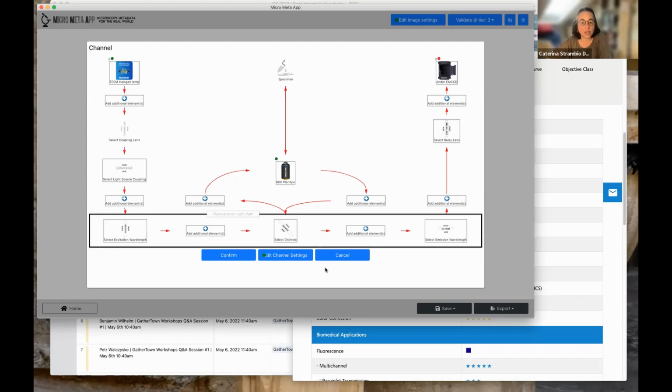People are not going to do it. I totally agree. Unless there are reasons, but if we find a way of meeting people somewhere along the usability spectrum that is closer to them, while we're waiting for things that are done automatically by the manufacturers, and we're working with the manufacturer toward that end. So we're not just doing this, we're doing all sorts of things to get to the point in which all of this information is going to be automatically provided. But in the meantime, what do we do? That's the point.